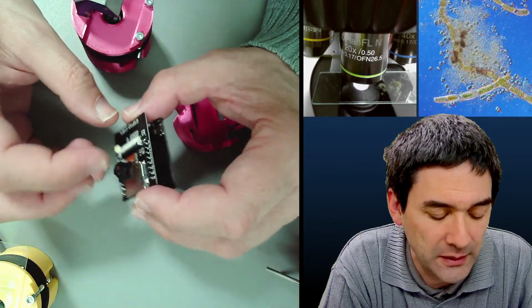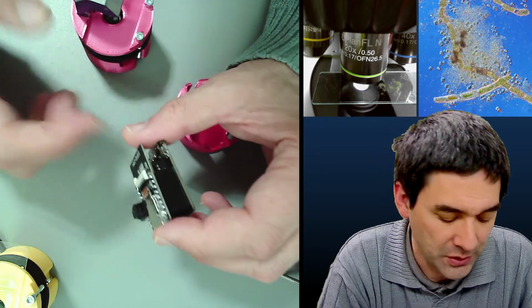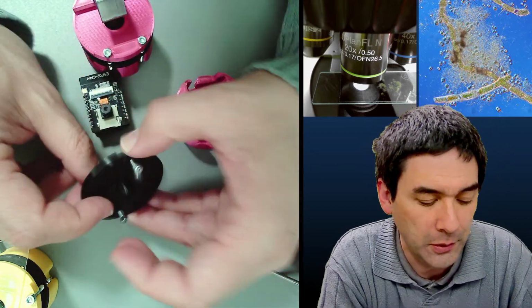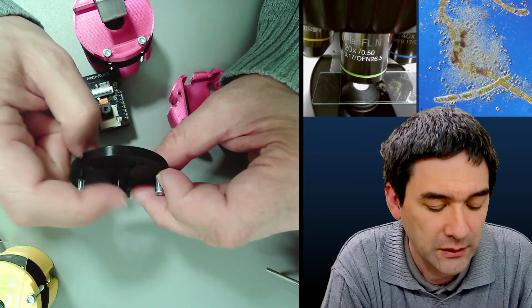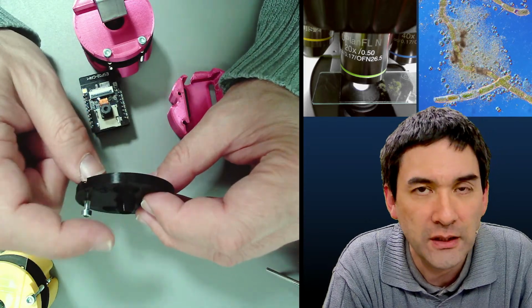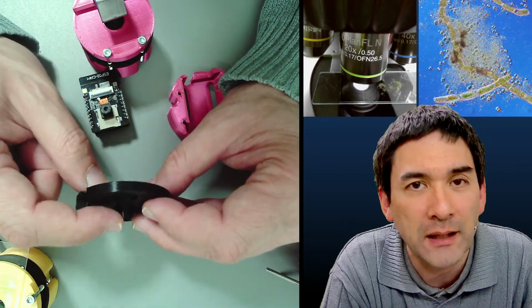How is it possible that this camera is able to magnify so much? The reason is that in this microscope, as I show you from the top part, there is a little extension here. The sensor is down here, and because of this extension, the lens is raised away from the sensor, and this increases the magnification.